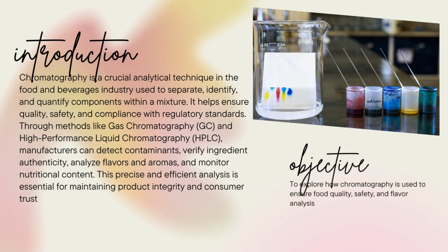The first part of today's presentation is the introduction. Chromatography is a crucial analytical technique in the food and beverages industry used to separate, identify, and quantify components within a mixture. It helps ensure quality, safety, and compliance with regulatory standards. Through methods like gas chromatography and high-performance liquid chromatography, manufacturers can detect contaminants, verify ingredient authenticity, analyze flavors and aromas, and monitor nutritional content. This precise and efficient analysis is essential for maintaining product integrity and consumer trust.